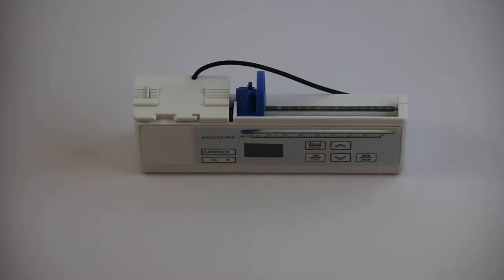Once you have unboxed your micro syringe pump, ensure that it is charged or connected to a power supply. The first step in setting up your syringe is to calibrate the syringe parameters for each syringe type that you are planning to use with your micro syringe pump.